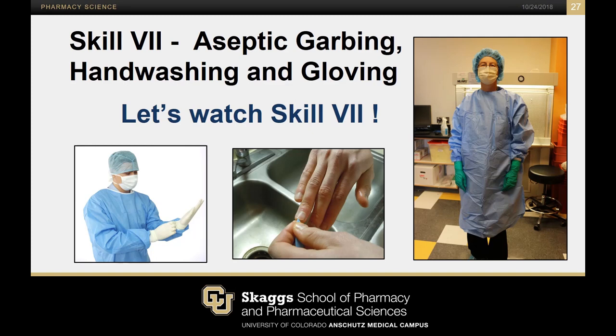This is skill 7, aseptic garbing, hand washing and gloving. This skill needs to be completed within 10 minutes.